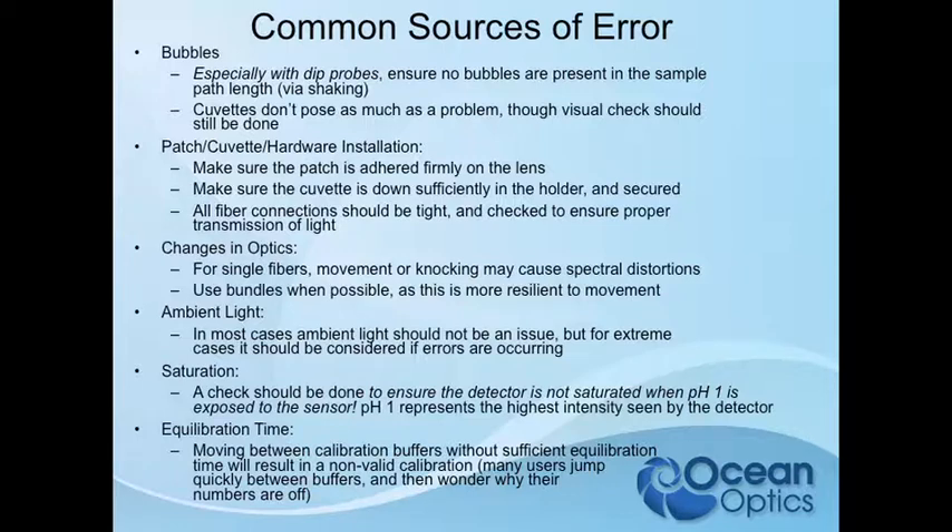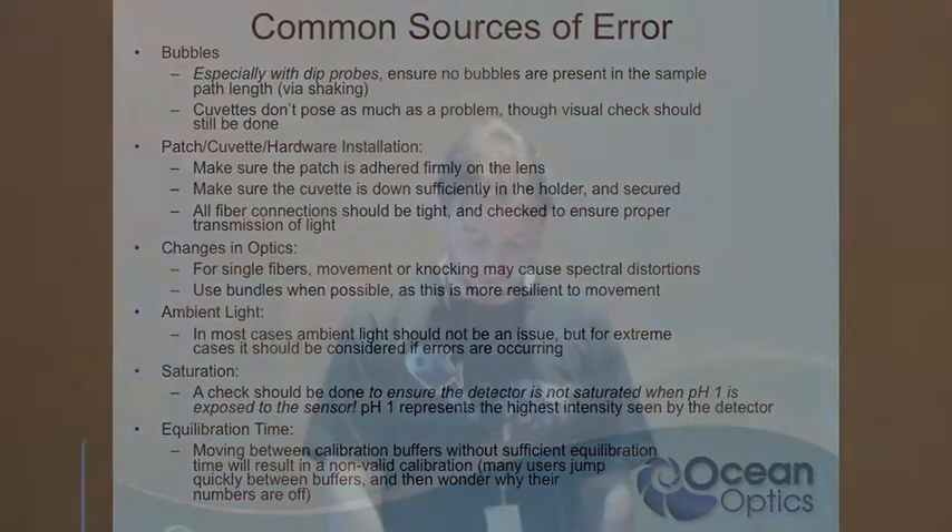Ambient light usually isn't an issue — it may be in extreme situations, like if you're outdoors, but that's usually corrected with no problem by taking a dark reference. Saturation is another issue — if you're saturating the detector, you're not going to see any change whatsoever. These are just basic things to keep in mind if folks are saying this isn't working or they're seeing errors.